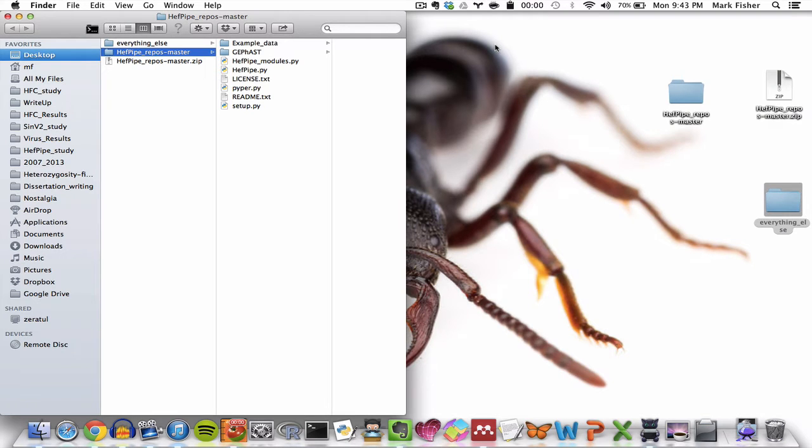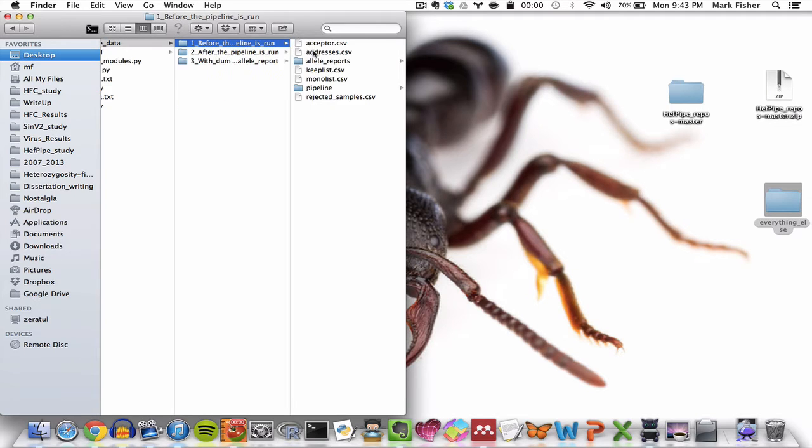In this video, I'll touch on some important points regarding the input files we discussed in the previous video. So let's dive right in. Regarding allele reports, I already mentioned briefly in the previous video that the first allele report in the allele report directory, when sorted alphabetically, must contain every sample used in all of the other allele report files. So let's take a look at what that looks like.